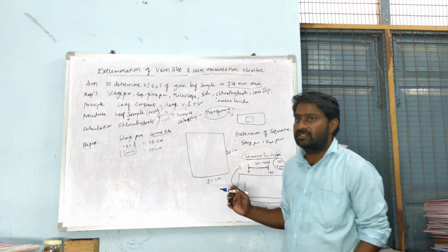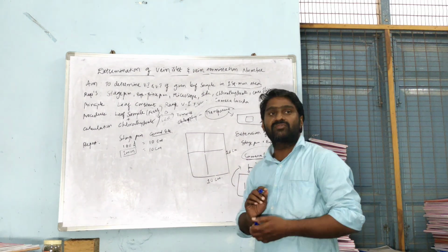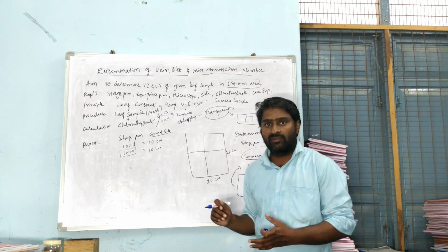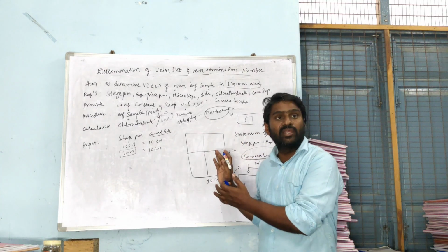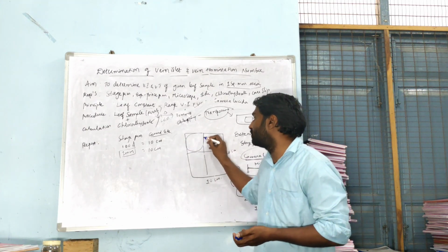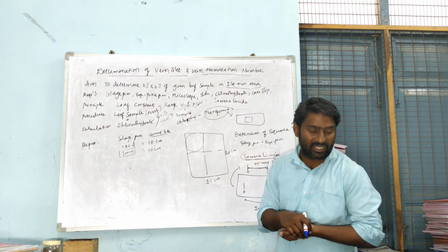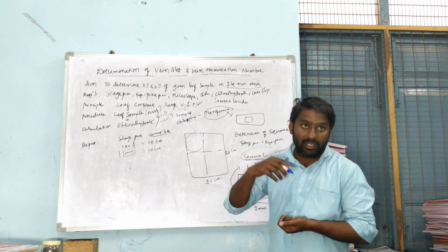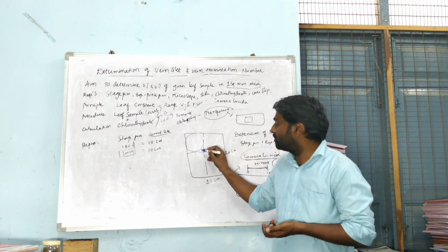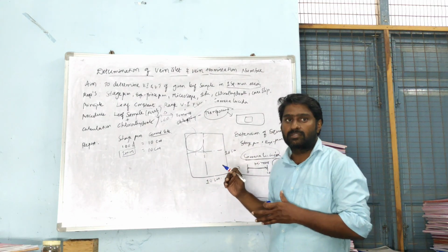But for our convenience, as the 10 centimeter area is larger and we cannot trace the image on the complete area, we are dividing the square into 4 equal squares. Now you can trace your image onto the first square, and the extensions which spread to the other squares, let them extend, whether out of the square or to the below square.